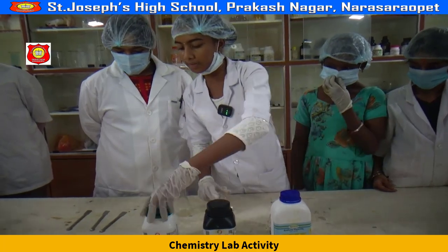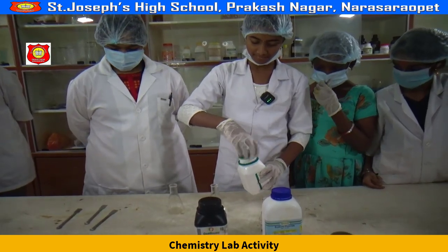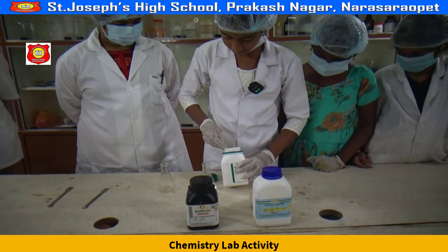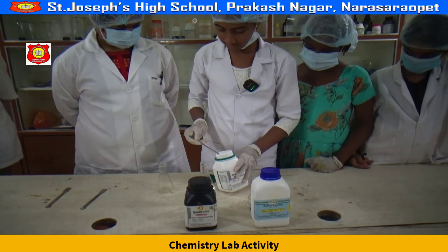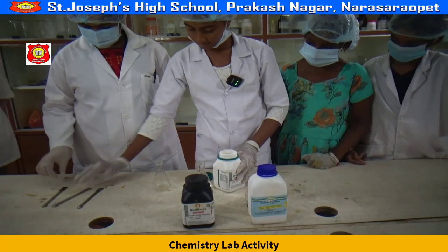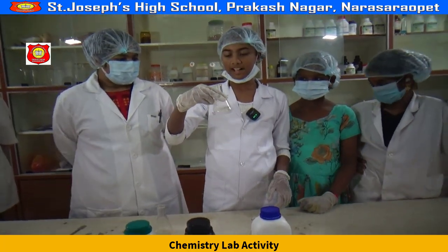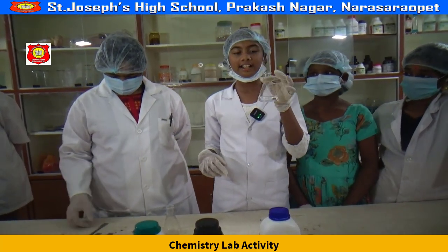Now let's add the potassium thiocyanate with a spatula. Now stir it well until it dissolves.